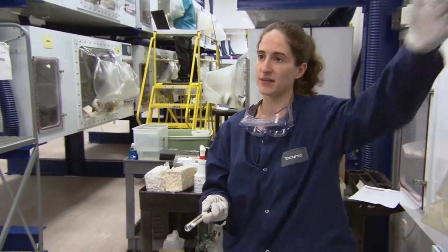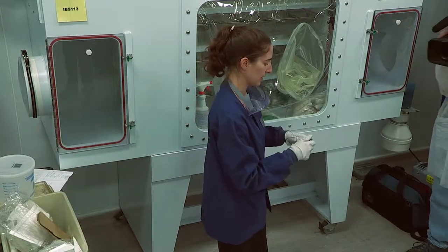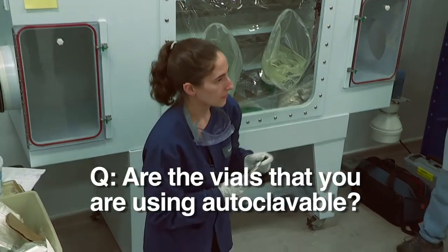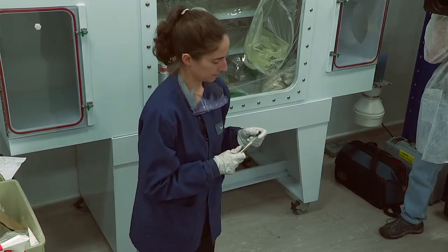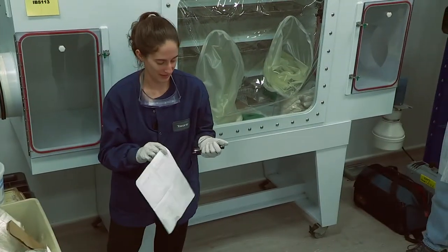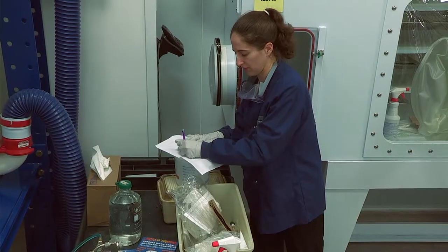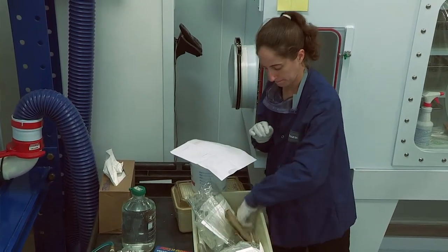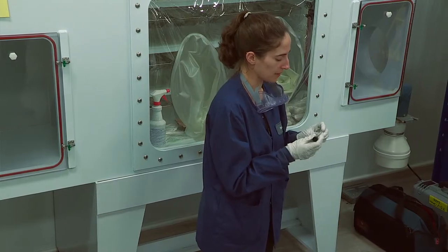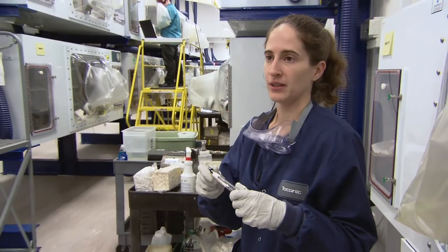We do two swabs independently covering the same types of areas — two different cages, the floor, two different spots on the ceiling — but we incubate them together in broth in an incubator. Are those vials that you're using autoclavable? These are, yeah. Do you have the specs on those? Because they were hard to find — I've not been able to find them. I don't, but I can get them for you. When you put swabs in, do you put them in small test tubes like that, or a larger container? They come in bulk and then we divvy them up into two because we need two sets of samples for each isolator.